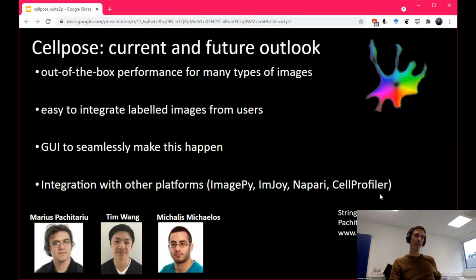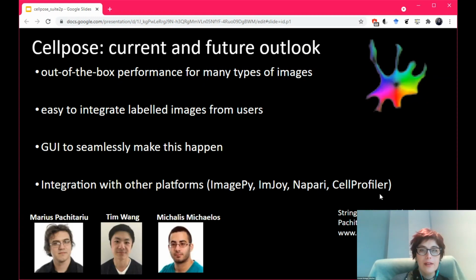Could you just train one thing? I don't think we'd lose performance on the nuclei if we did. One thing with the nucleus model is the images weren't as high resolution, so it's trained at a smaller diameter. The cell images are trained with a diameter of 30 pixels. This is something I didn't talk about: we found that the algorithm works better if it doesn't also have to generalize across size.